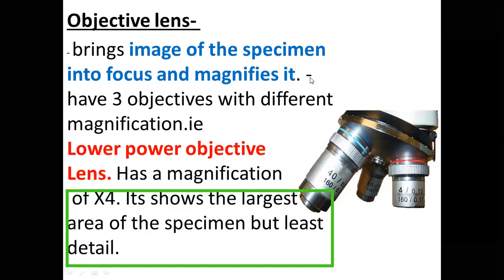And the converse is true. The higher the magnification, the lower the field of view. So inaenda ikiwa kidogo. So you count more cells. No, you count fewer cells, but you see more details. So the converse is true. The higher the magnification, the lower the field of view, but the more the details, the higher the resolution. So make sure that you get that idea. If you miss that, it will not be so smooth for you.